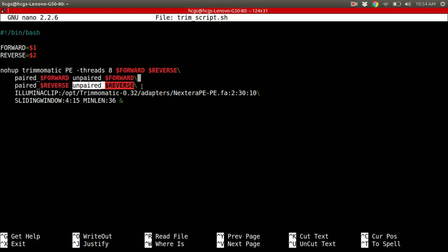And this is a bit of a long line. It's one whole thing. This first part is saying that what I'm going to give it is the pathway to a set of adapter reads. Now, when you use something like Illumina, you're going to get a set of adapters that might still be stuck onto your reads. And we can look for them and we can trim them so that they're no longer on those reads. So it's going to shorten those reads based on the size of that adapter.